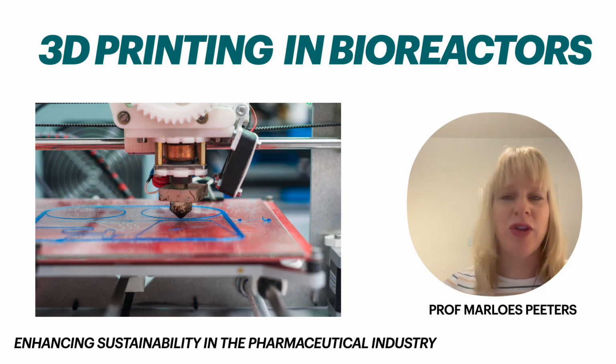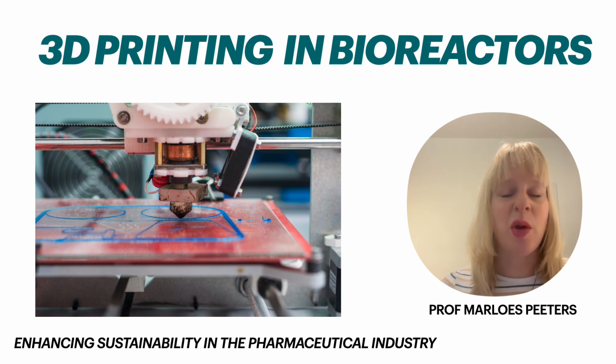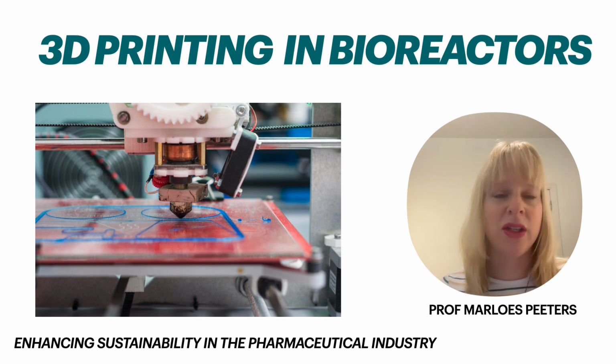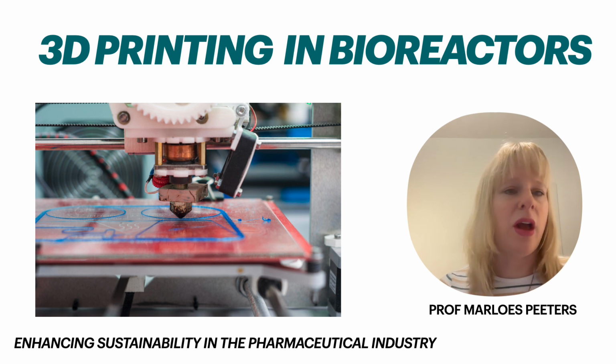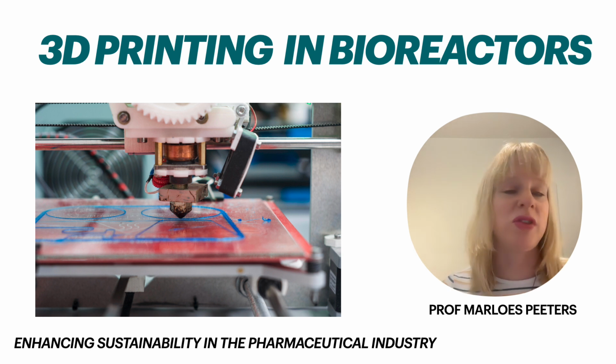Generally you create less waste when you use 3D printing, and you can even 3D print from renewable sources. So that's why this might be very appealing, especially when you use single-use bioreactors, where you can look at other materials going beyond, for instance, glass or just traditional stainless steel.